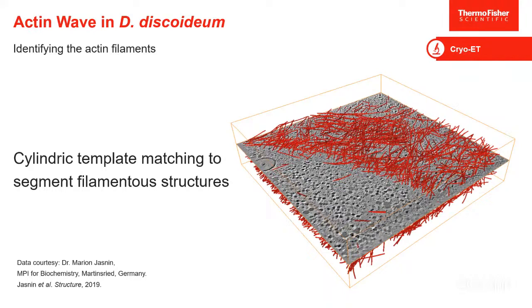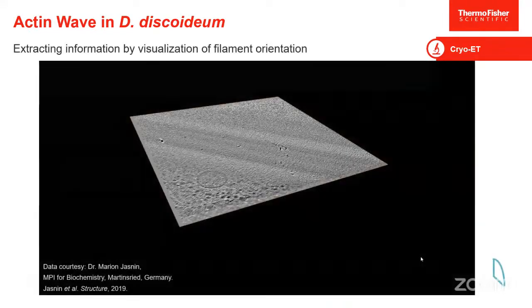But assuming you can, and maybe using the deep learning tools, you can not only trace each one of them using the deep learning segmentation, but then each one of them can be quantified for their angle of direction. And so, Tianbo, if you would change it to that color coded one, or maybe it might be in the middle of one of your videos.